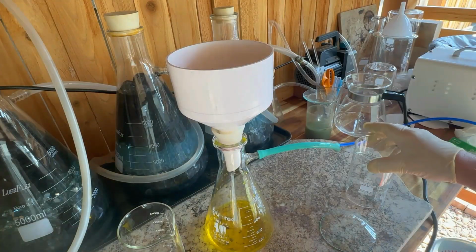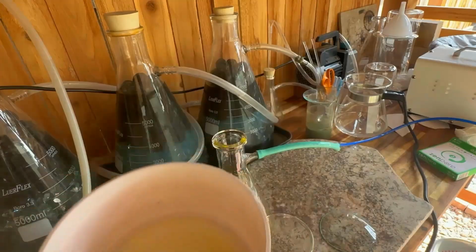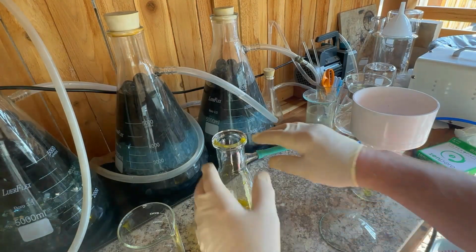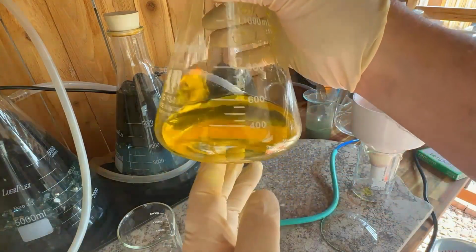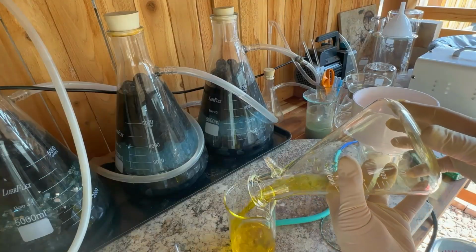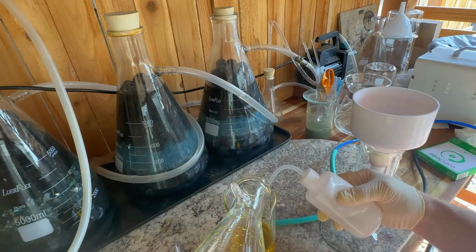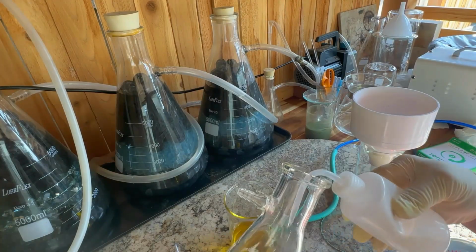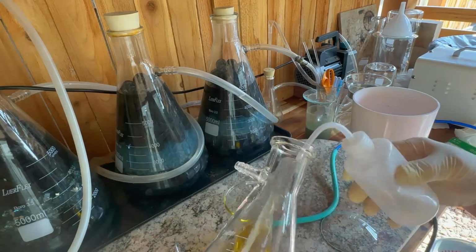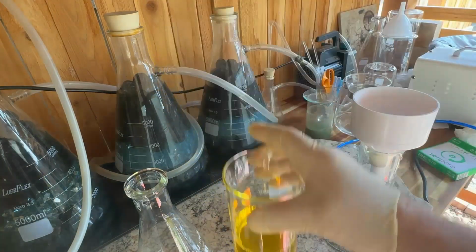First filtration is done. You can see in the flask that the solution is significantly clearer. We're going to go ahead though and take a closer look at that. It's clearer, but it still has a little bit of cloudiness to it. See if it looks better here if I hold it up in the beaker. In any case, we're going to filter this again, and hopefully if you look at this and you look at the filtration afterwards, we'll see the benefit of always filtering one more time.